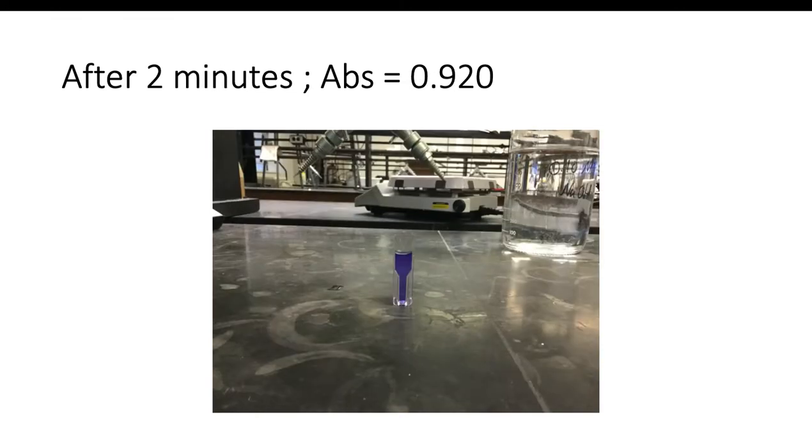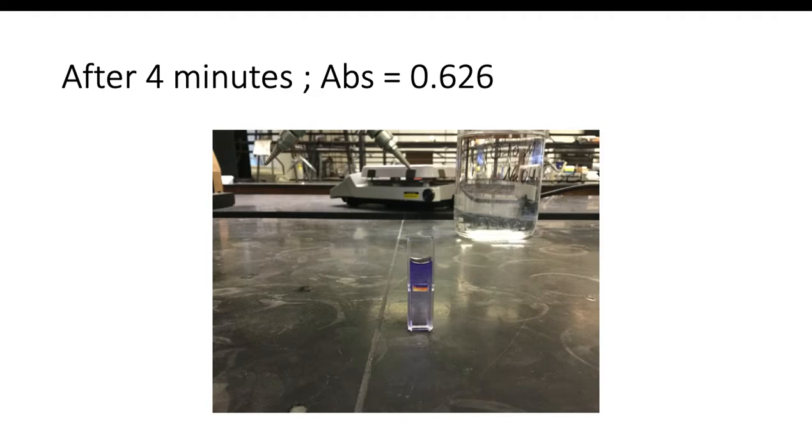I know I'm not the world's best photographer, so I apologize if you have to bounce back and forth between these images a little bit. That's okay. We do see it start to lighten in color, and as I progressively go through, you're seeing, okay, it's getting a little bit lighter yet after 4 minutes.